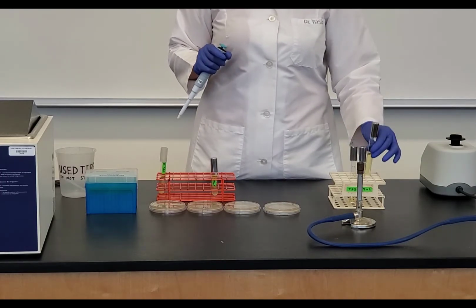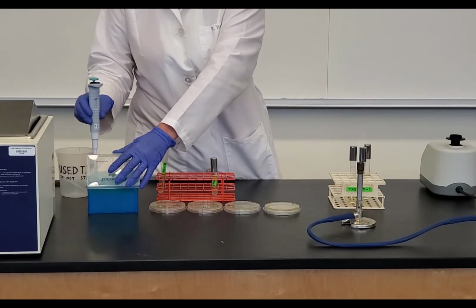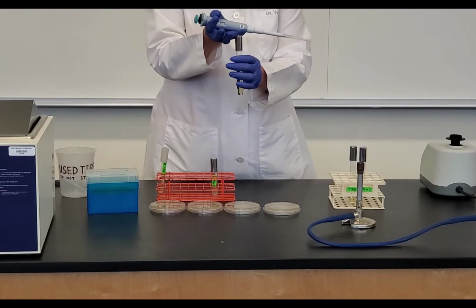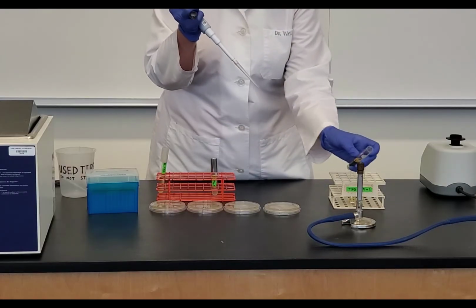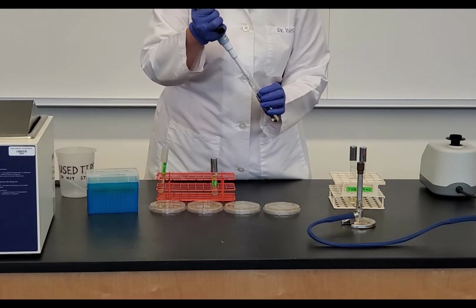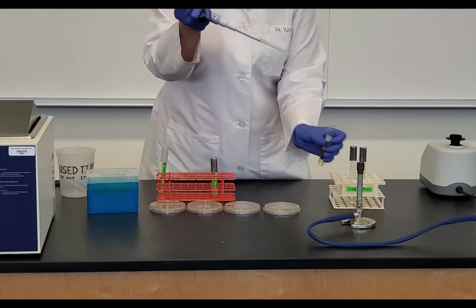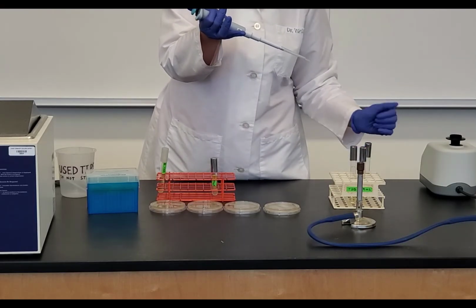Okay, so I've mixed that well. I'm going to get a new tip. So here is my pipette with the new tip. I'm going to take my tube, cap between my pinky and ring finger, take the cap off, flame it, push to the first stop, release my thumb to get the liquid in the tip, flame it, go under. I'm done with that one.